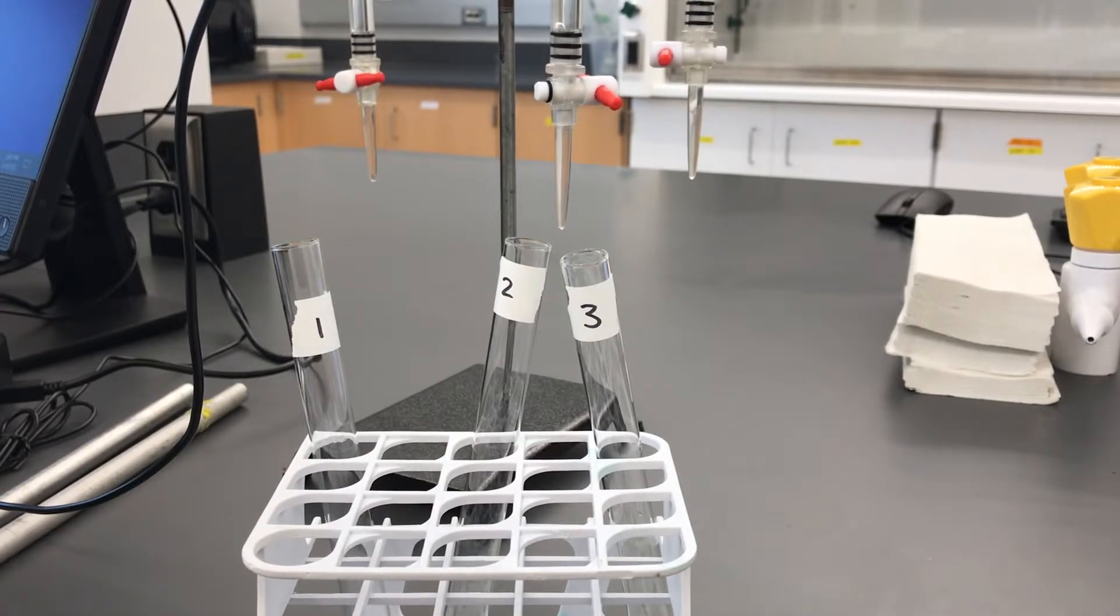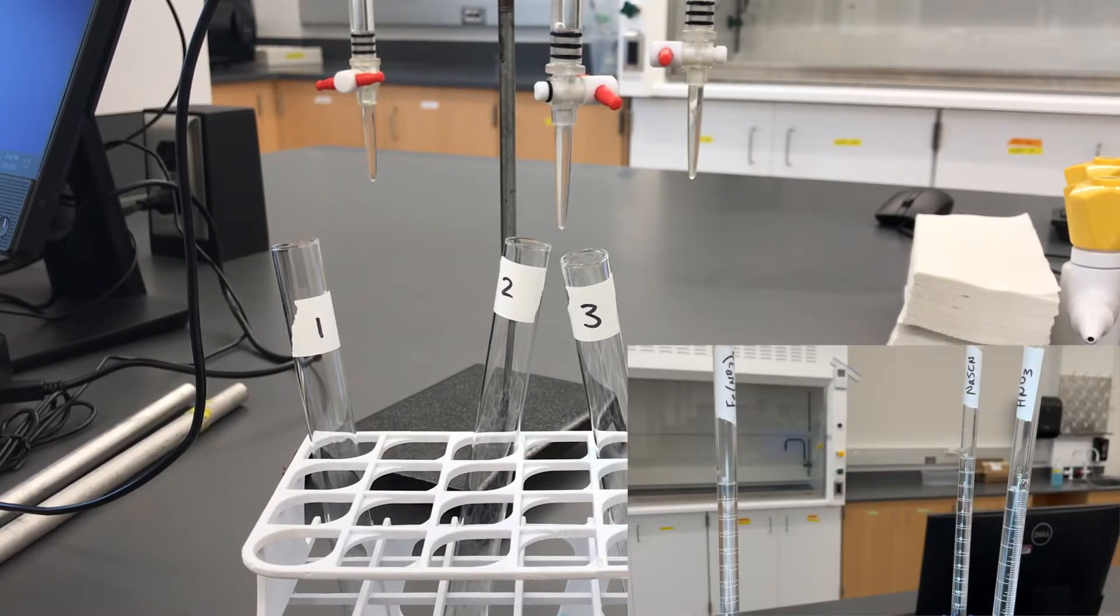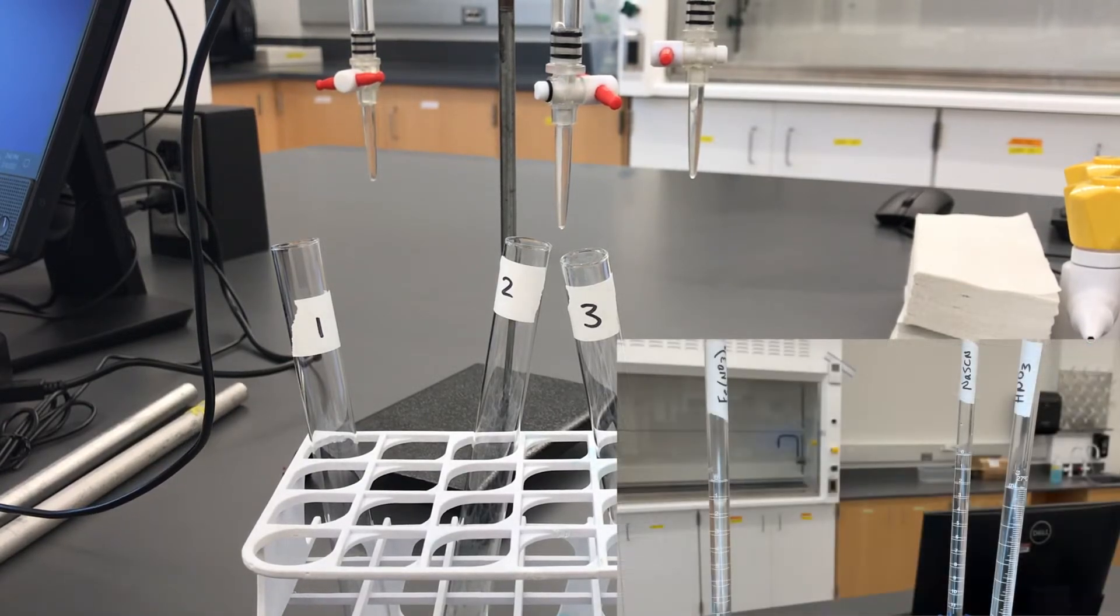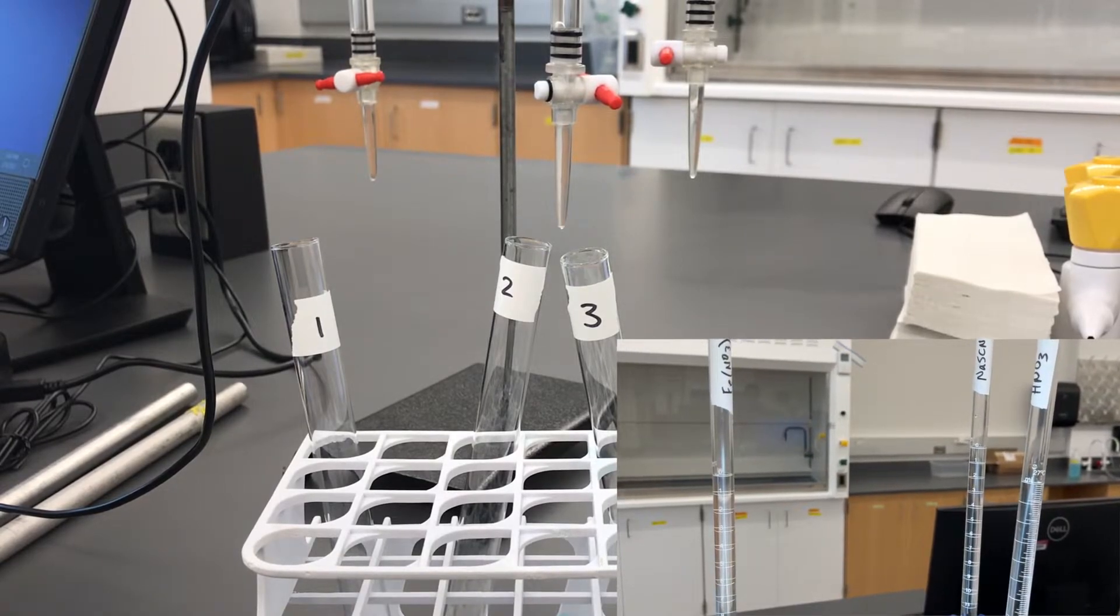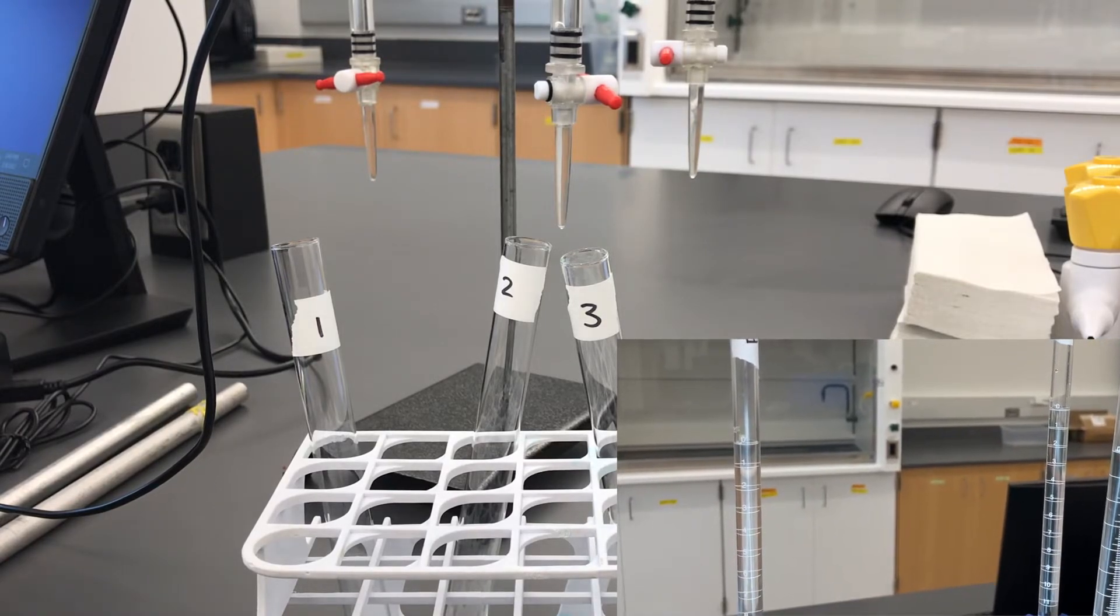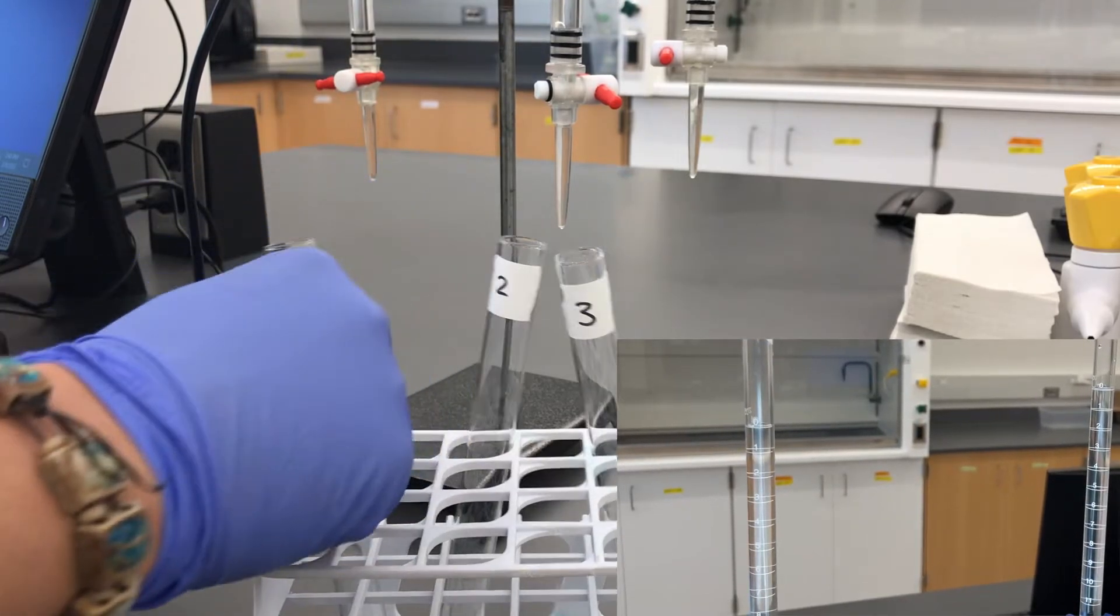We can now determine the equilibrium content of our iron complex formation reaction by making three more solutions. We have three labeled test tubes, one, two, and three. And this time we'll use the less concentrated ferric nitrate, and again nitric acid, and our sodium thiocyanate. This time, however, we have to know exactly how much of each reagent we are adding as compared to last time. So we will need to use some additional burets for dispensing the nitric acid and the ferric nitrate. So to make our solutions, we need to first add about five mils of our ferric nitrate to each test tube.